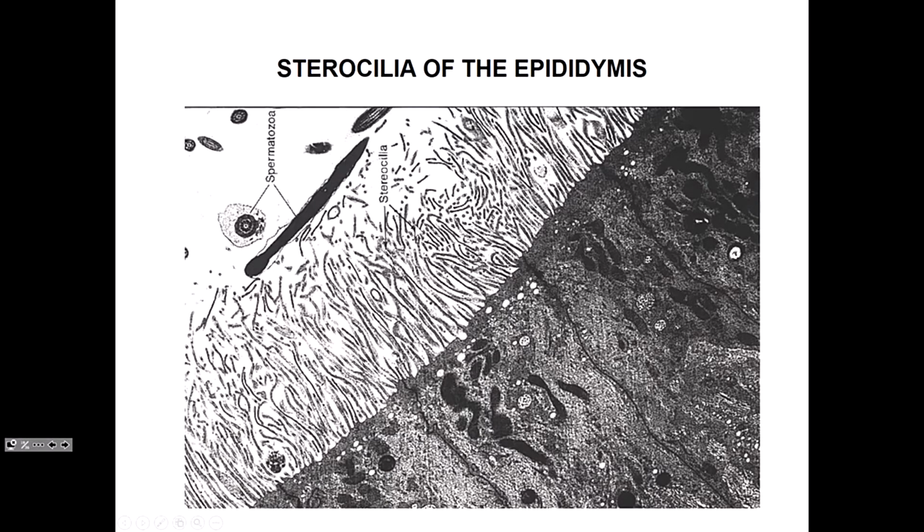Okay? So again, we looked at something else over here, we recognize it, that tells us what the organ is, and then because we know what this organ is, we can identify these as stereocilia because of what we know about the structure of the epididymis. So sometimes you have to look around and look at other stuff to be able to identify a particular tissue to answer the question about something else, okay? So take the whole thing in context. Any questions?